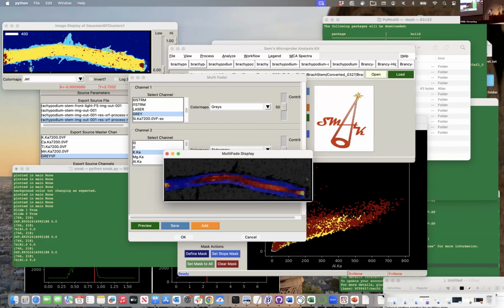And so that's the next layer of this. It's going to be a bottom threshold where you have a transparent layer if it's below a certain value, and then your color map goes from there up. That's my last idea I had last week. It's not quite in the program yet, but it will be in the next version. Again, I think a multi-layer TIFF like that would also be very helpful. That'd be easy to implement as well.